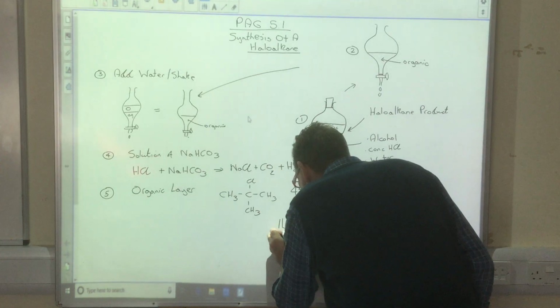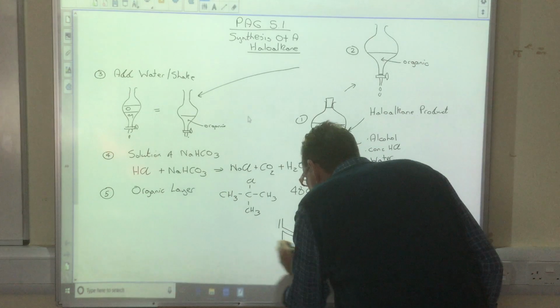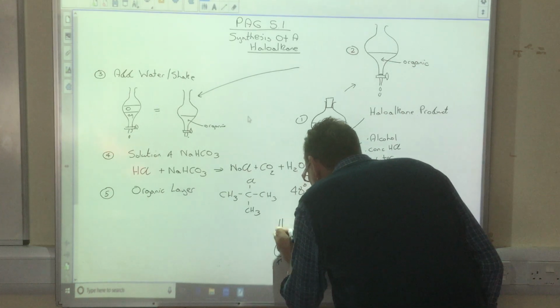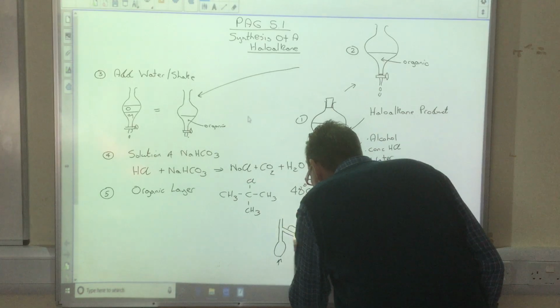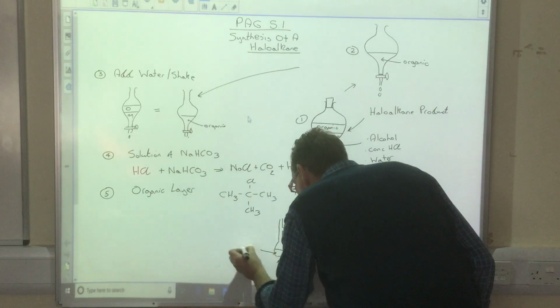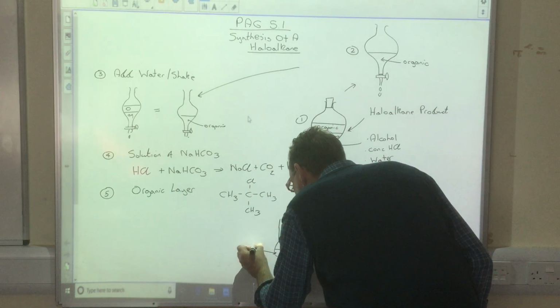I don't need any of this in the exam. Heat, water jacket, you know the score. Just the organic haloalkane in there.